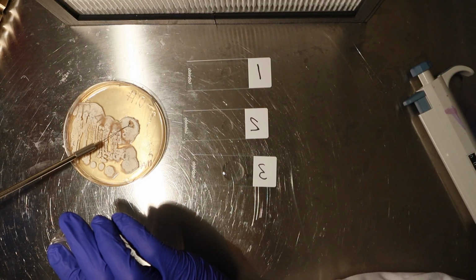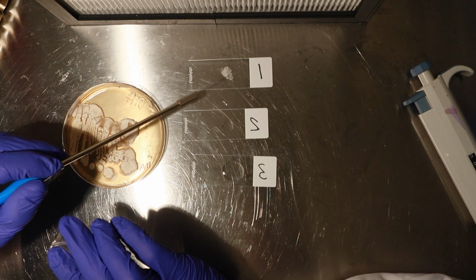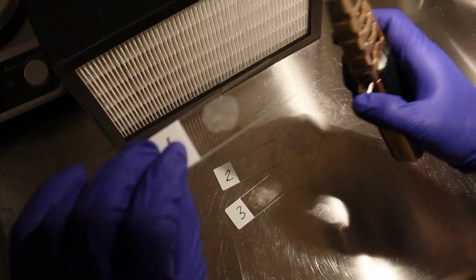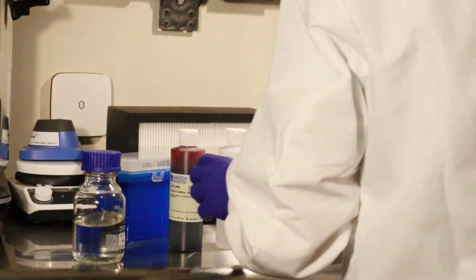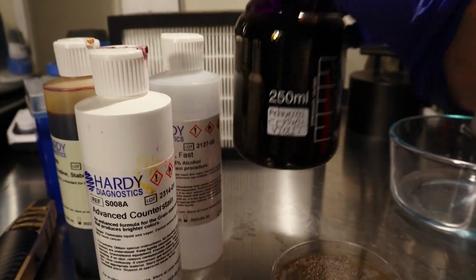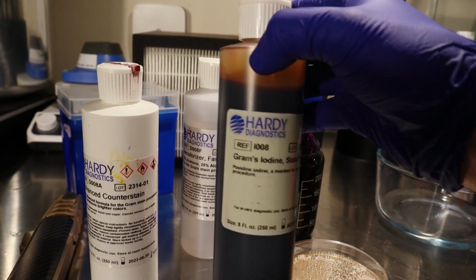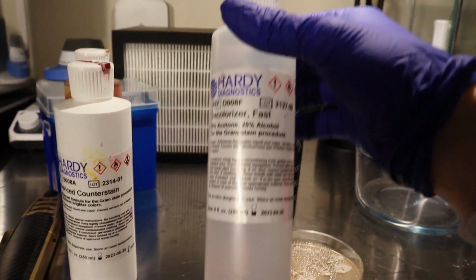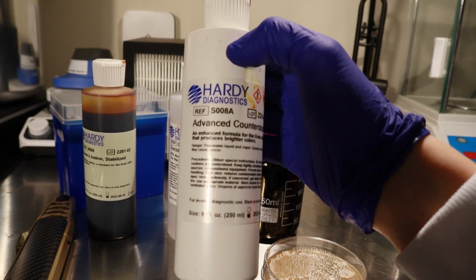I used my inoculation loop to smear an isolated colony and a drop of distilled water on my microscope slide, and waited for it to dry. Upon drying, I passed it through the torch 2 to 3 times, and it was now time for staining. I got out a bottle of crystal violet, Gram's iodine, which plays a part in trapping the crystal violet in the gram-positive bacteria, decolorizer, which is basically an alcohol and acetone mixture, and counterstain to stain everything unstained by the crystal violet.